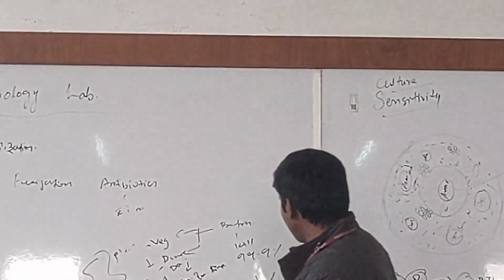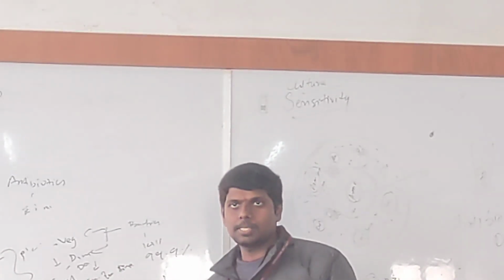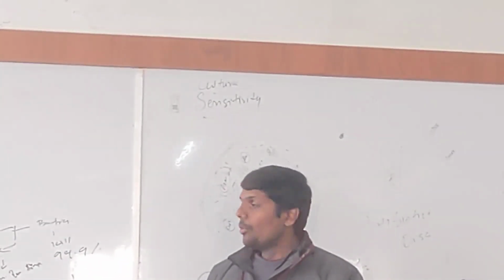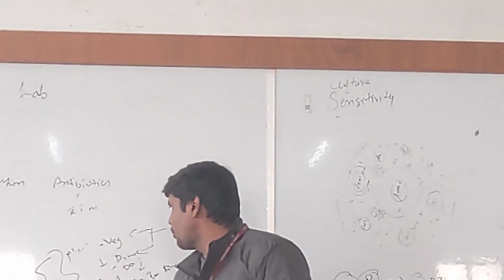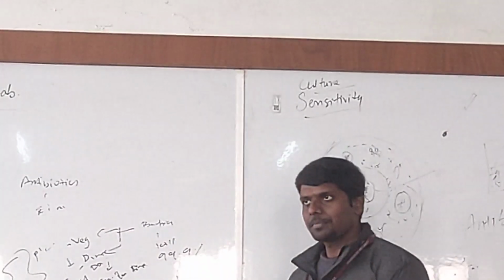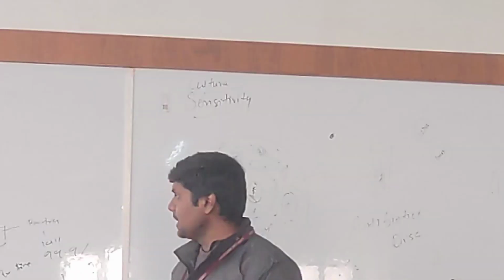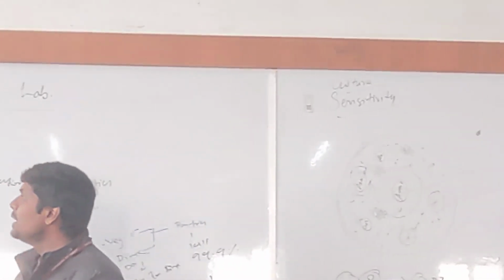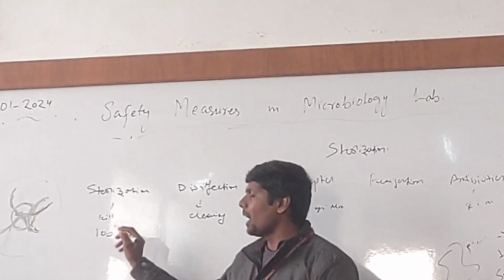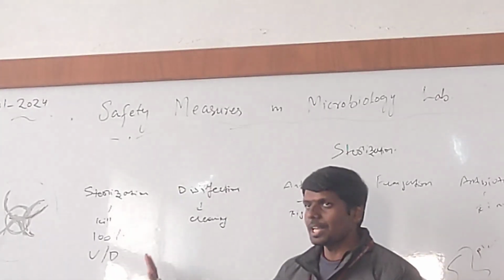So now this 0.1% is these seeds actually. Killing seeds, spores, is very tough. Now the same challenge we will encounter in microbiology. We need to kill both the vegetative form plus the dormant form. That will be 100% killing. When we can kill 100%, that process is called sterilization. In sterilization, there will be 100% killing of both vegetative form and dormant form.